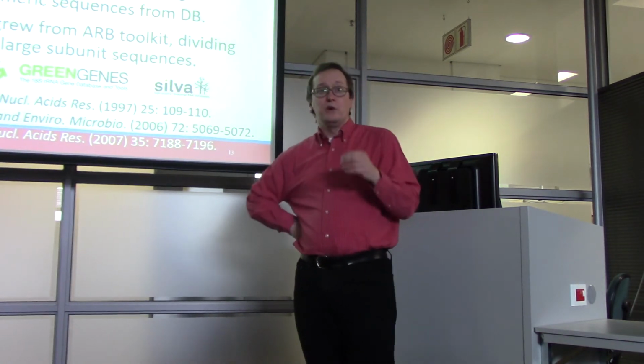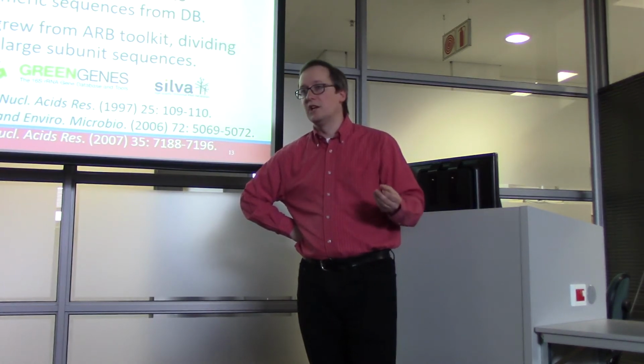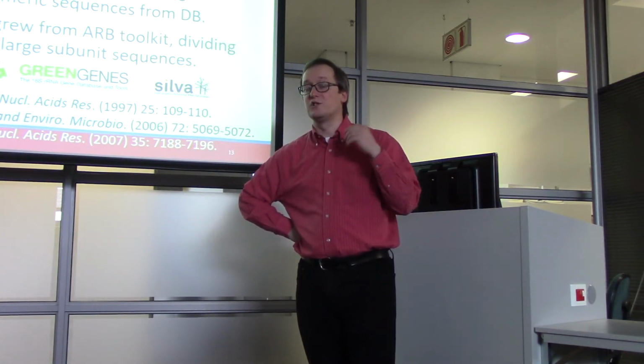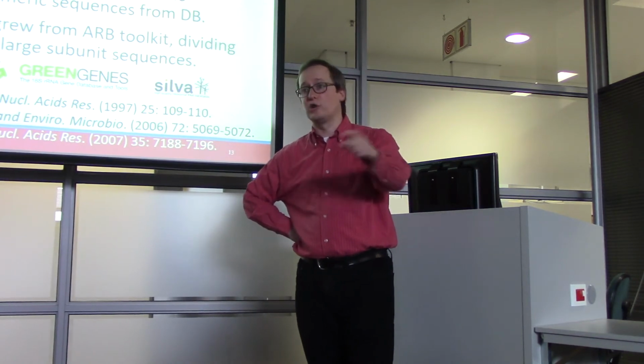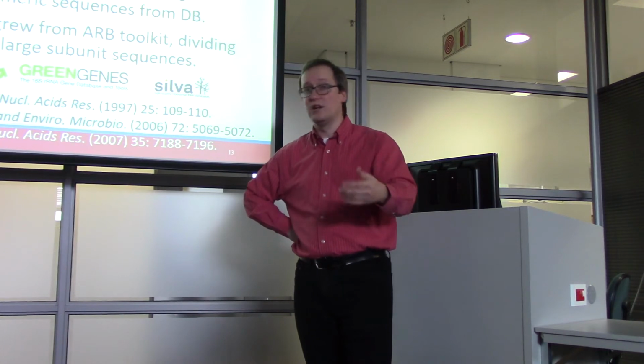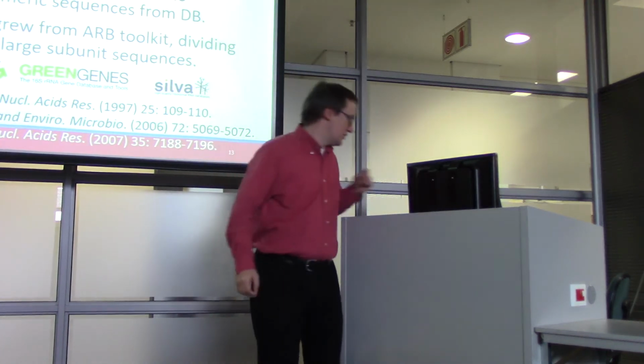So before you do your OTU assessment of sequencing reads, it probably will behoove you to read a few of those papers to ask, is the database I'm planning to use to look up my sequences well covered in the species I care about? Okay, so on we go.